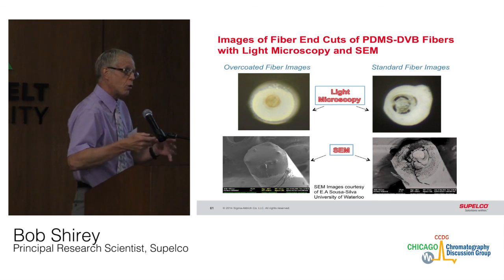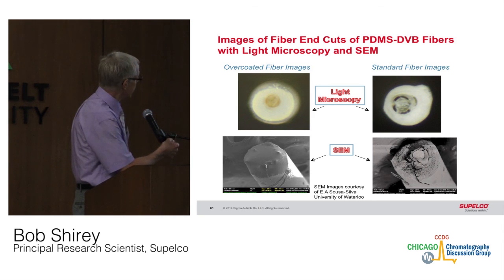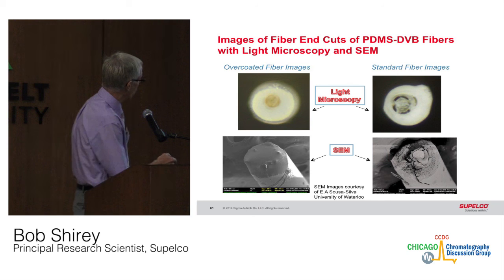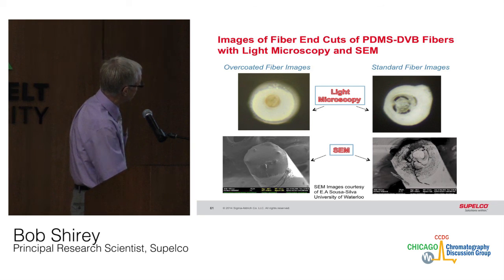The nice thing is we dip coat the final fiber. What that does is seal the end of the fiber where it is normally cut, and it also seals where the fiber is attached to the needle. So you get 2 effects of sealing the matrix from getting in. Where the fiber is cut, you can get fine cracks and openings where the matrix can get into the fiber coating. It can cause a little bit of chipping around the very tip of the fiber coating, whereas the overcoating does protect that end. Again, you can see the core, the StableFlex, and then the adsorbent around it.